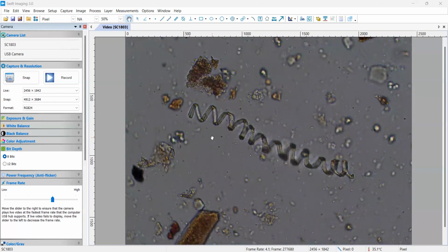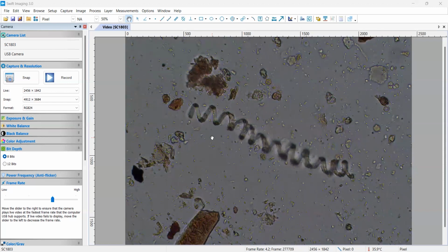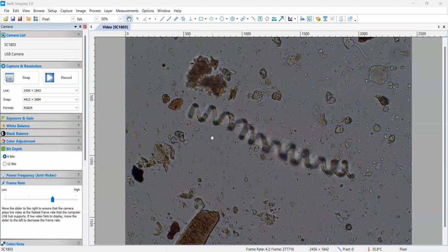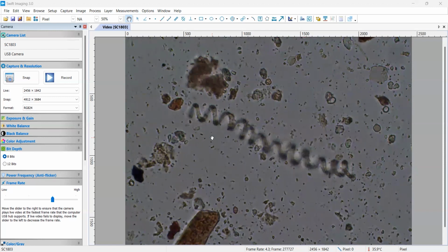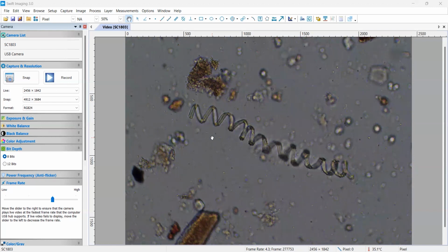So this is a compost that I'm looking at. And so at some point, this compost got really hot in a good thermophilic stage, and it made us a good compost. And so there's quite a few of these cellulose pieces in this sample. And so that's a good thing.